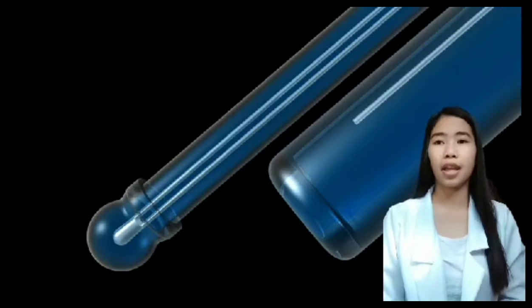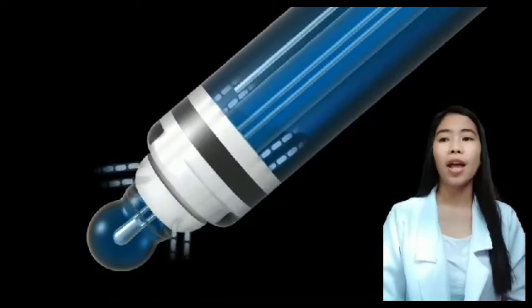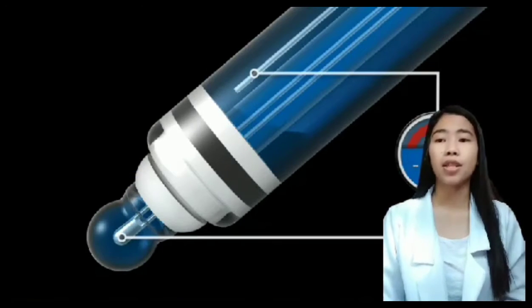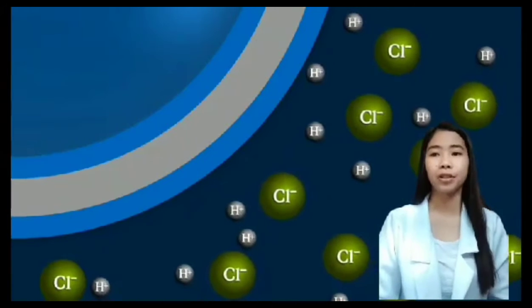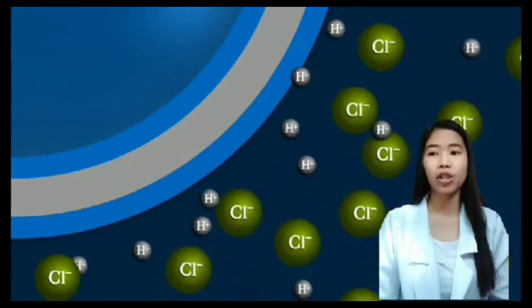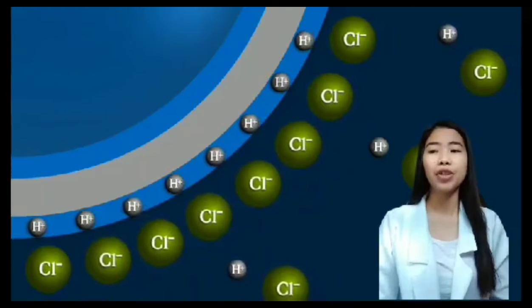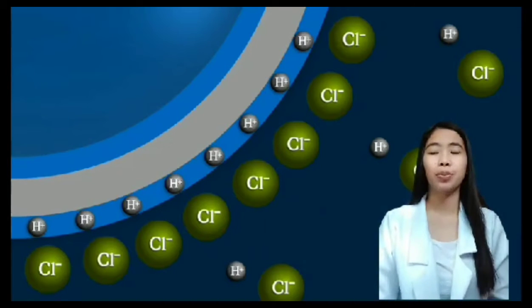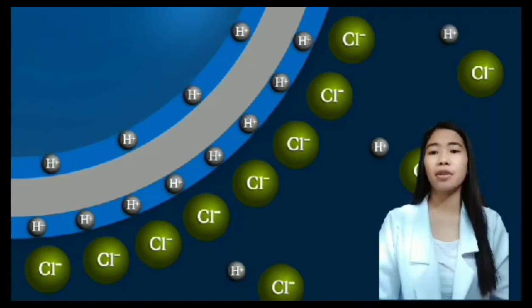The reference system is located in the outer glass tube and also consists of silver chloride wire and the potassium chloride solution. Let's take a closer look to understand the pH-sensitive glass bulb. Diluted hydrochloric acid, for example, contains large negatively charged chloride ions and small positively charged hydrogen ions. When the pH sensor is immersed in this acid, the hydrogen ions are able to penetrate the boundary area of the glass membrane, the so-called gel layer, while the larger chloride ions remain in the solution.